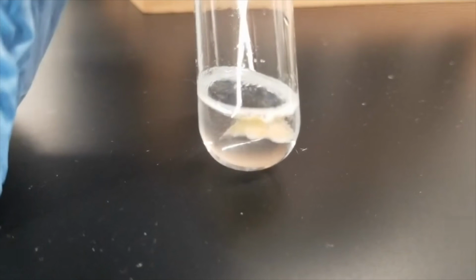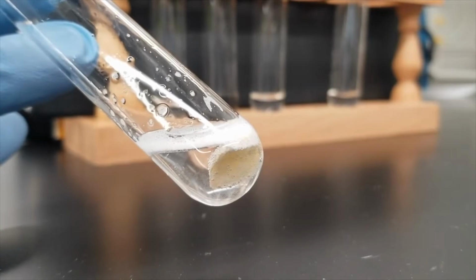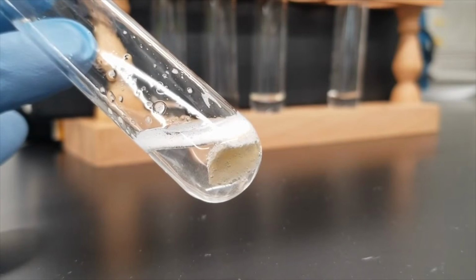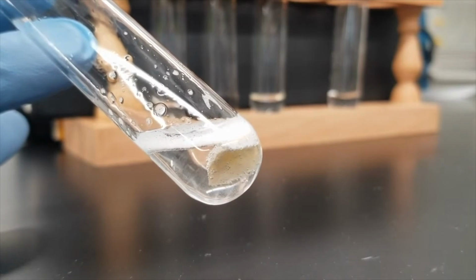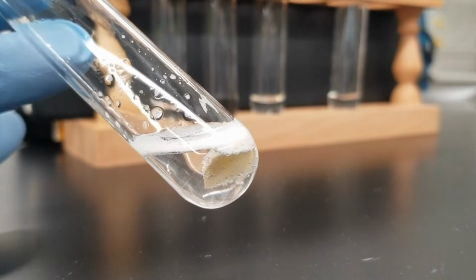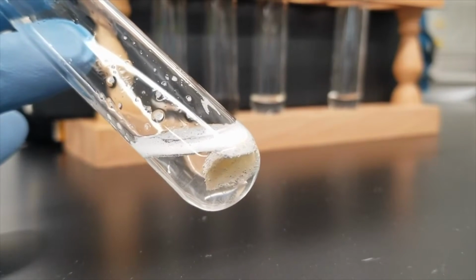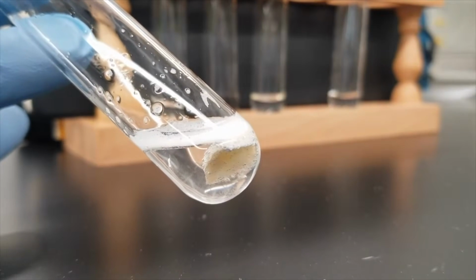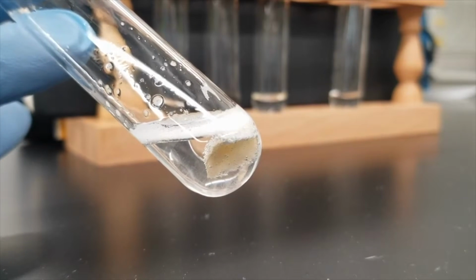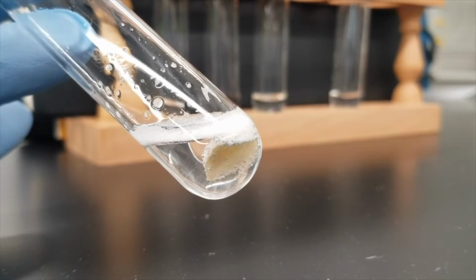There we go. You should be able to see the bubbles coming off of our chunk of potato. Okay, so hopefully from this angle you should be able to see a stream of bubbles coming off of our potato. Please make a note of that. Feel free to make a note of the rate at which they're coming off if you want to compare them. I believe one of the questions in this section of the lab asks you to decide which is the best catalyst we have. So determining how quickly the bubbles are coming off of our potato might be something to keep in mind when you're comparing the effectiveness of the different catalysts.